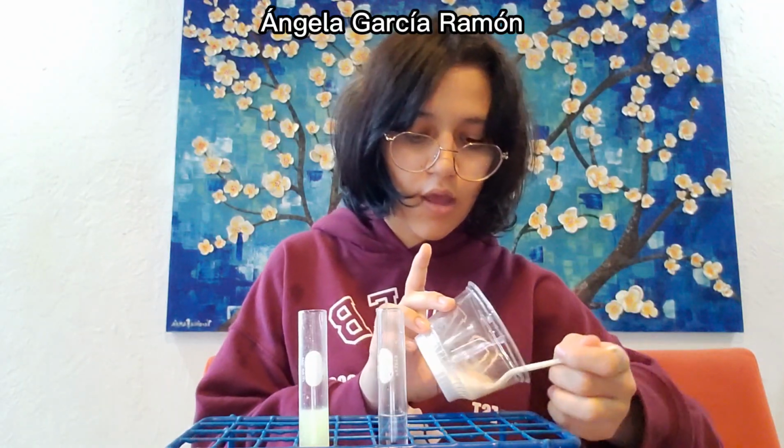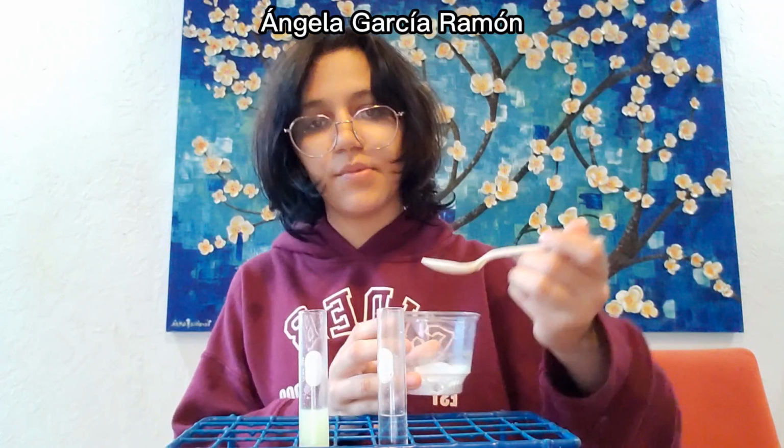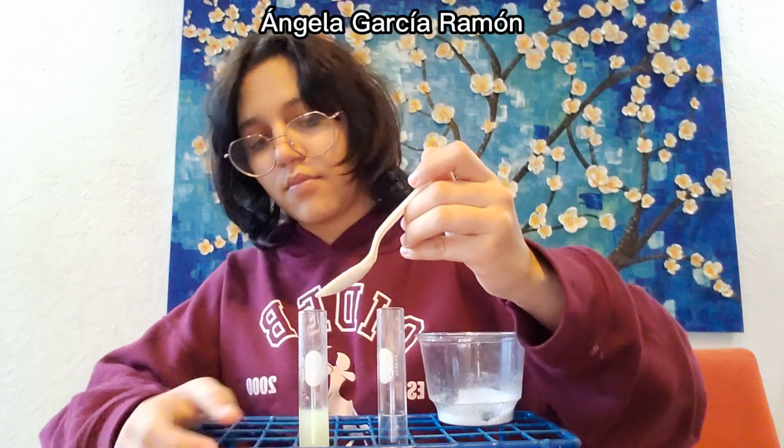This experiment only consists of 2 steps. The first one was to serve both the lime juice and the vinegar in their respective test tubes. The second one is to take a spoon of sodium bicarbonate, about this much, and see the reaction.